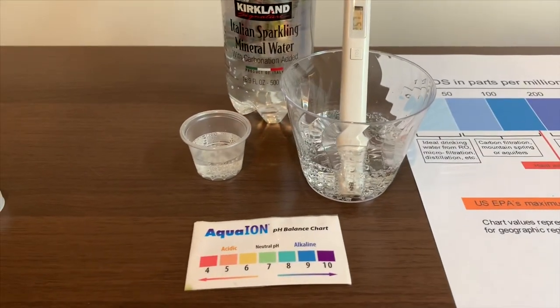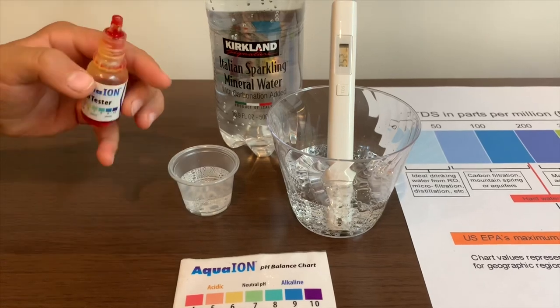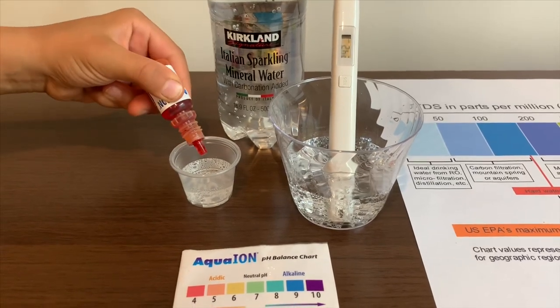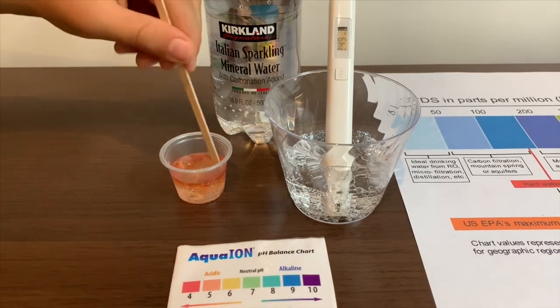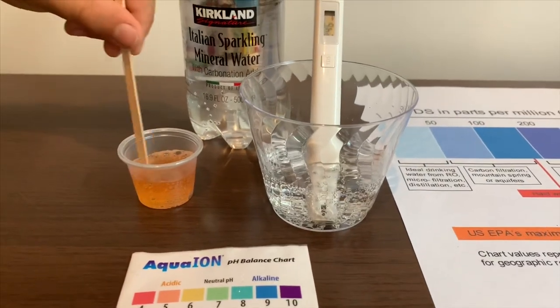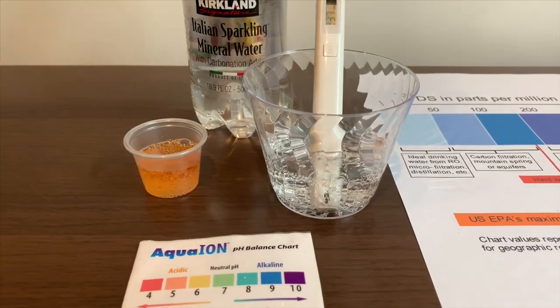Now, let's test the pH level. If you want to buy this pH tester, check the link down below. Only do two drops. Let's stir it a little for a better result. I'll give this a 5.5. This is acidic.